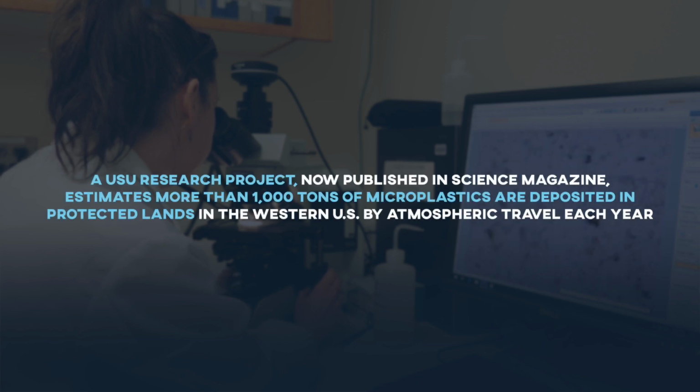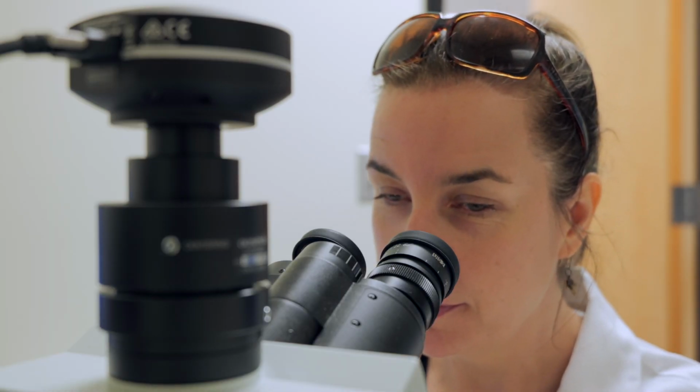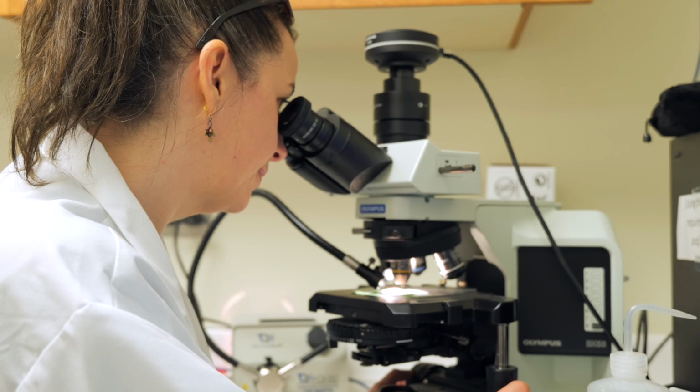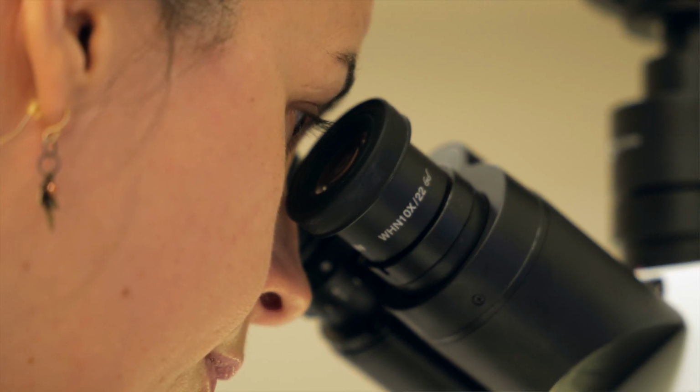Because I was really interested in what dust is composed of, minerals or organic matter, and if I could identify any of those particles, I started looking at samples under the microscope. Within those samples, I counted more than 10,000 fibers and more than 4,000 particles.